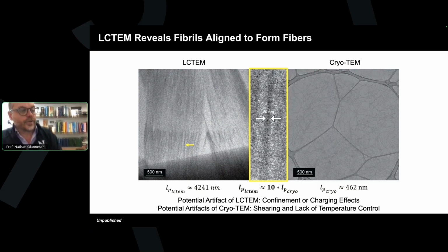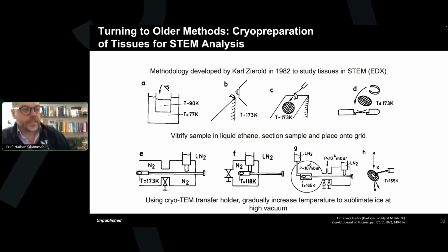Now, what we said here, of course, was, as I've written down, as actually Nathan made these slides, this is a potential artifact of the experiment, of course, right? So is this true, or are you making some completely unusual material in the liquid cell that just doesn't exist in any other state? We did a whole lot of experiments, he did a whole lot of experiments, including some high resolution fluorescence microscopy to try to capture whether or not we have these, first of all, larger micron scale bundles, and whether we have these large persistence length materials.